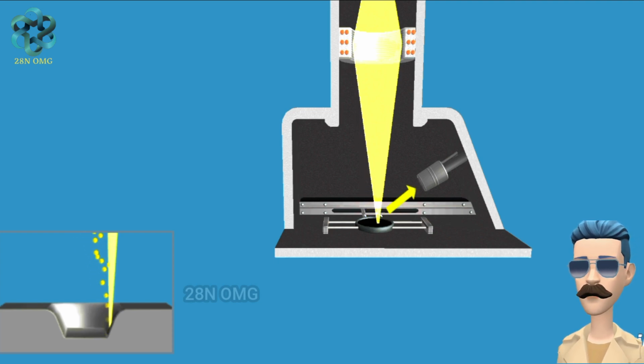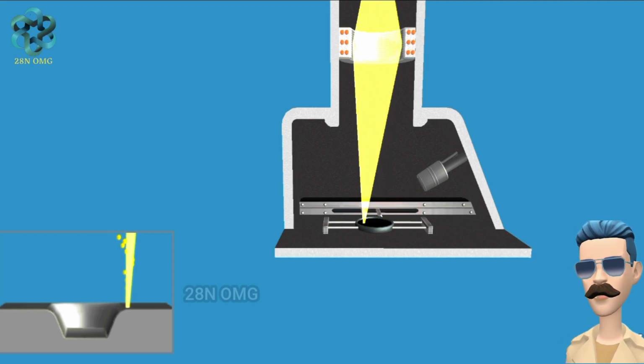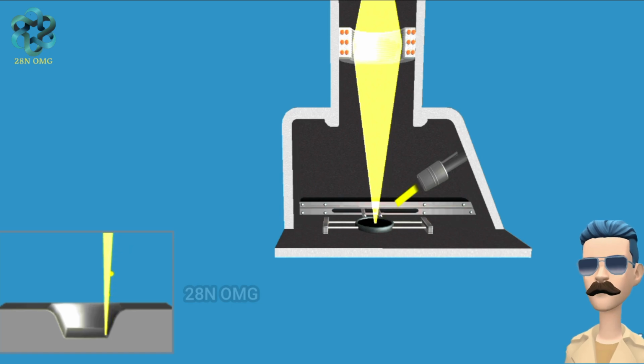The quantity of these in one direction depends on the angle of the electron beam and the surface. The detector measures the quantity of reflected and secondary electrons. The image is created from these data by a computer.